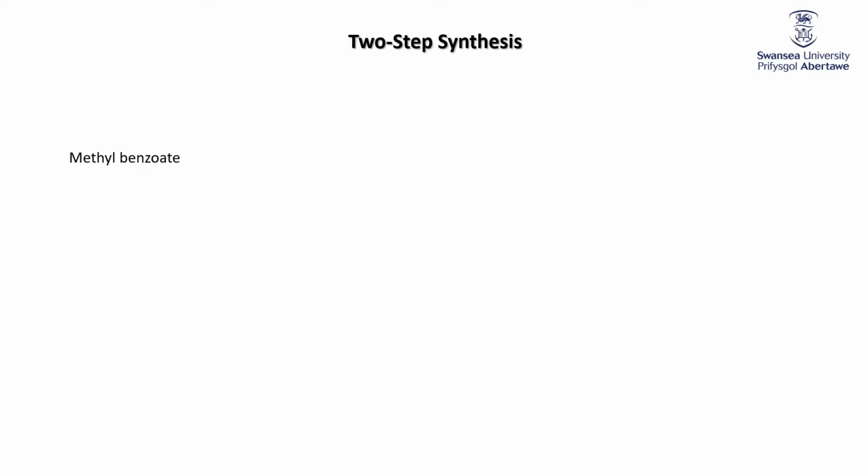So what you're going to do is take this compound here, methyl benzoate, which I will draw like this in a skeletal fashion. You should all be familiar with skeletal structures like this one. If you're not, no big deal. You will have it all revealed to you, and my colleague Sanjeev takes over from teaching in about a week and a half from when I'm writing this. But anyway, this is methyl benzoate.